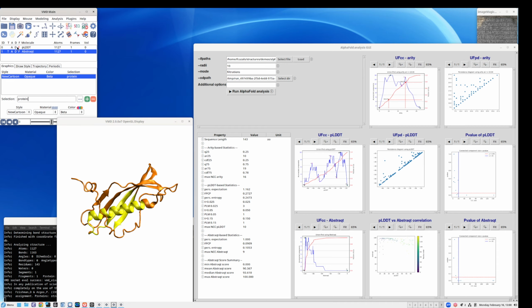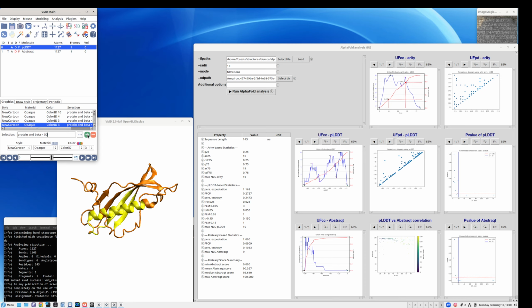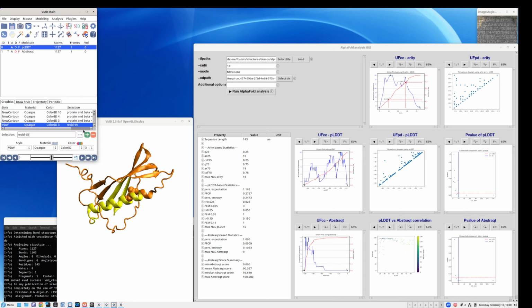So before doing this, I need to introduce a piece of machinery, and in order to do this, I'm going to make two VMD selections. For the first one, I'm going to select one amino acid, let's say resid 95, and I'm going to display it using the van der Waals mode. And so now you see the atomic balls of amino acid number 95. I'm going to make another selection, and in fact I'm going to select all the C alpha carbons, so name CA, within 10 angstroms of this residue, so within 10 of resid 95.